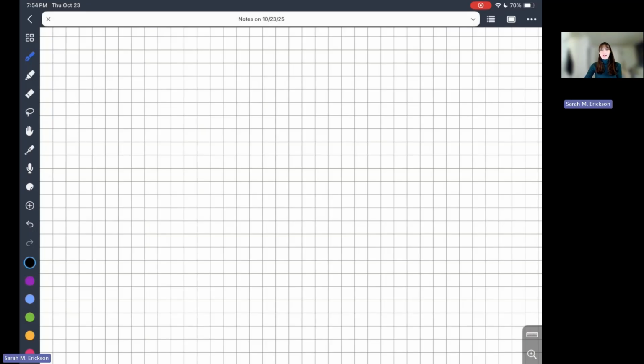I'm doing my usual CHEM 1065 lecture video about how to work up all of your data for the food dye lab, but this video has been updated for fall 2025. We switched out software, so my old one just has some different things.